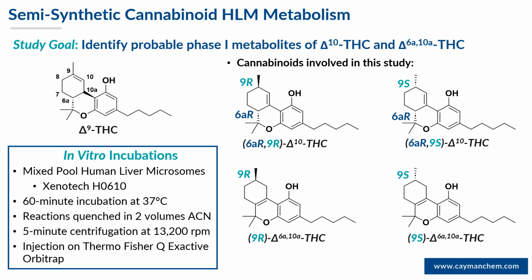Our in vitro incubations were run using mixed pooled human liver microsomes. Incubations were run for 60 minutes at 37°C. The reactions were quenched with acetonitrile and then spun down and injected on an Orbitrap to help identify what those phase 1 metabolites are.